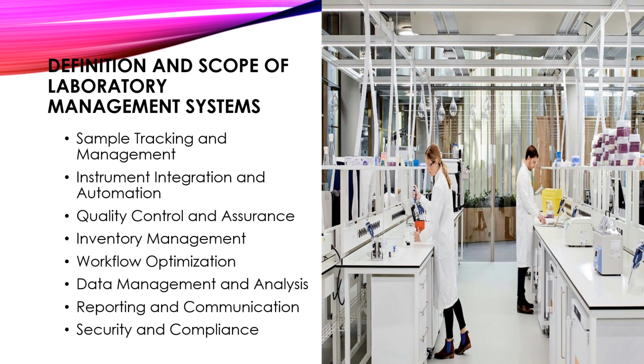Data management and analysis. Laboratories generate vast amounts of data from various tests and experiments. Laboratory management system centralizes data storage, organization, and retrieval, providing secure access to authorized personnel. It may also include built-in analysis tools for data interpretation, visualization, and reporting.